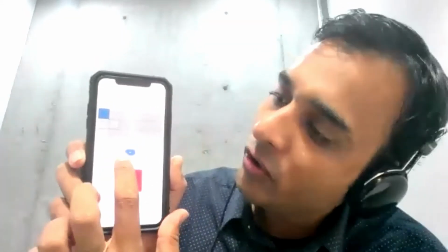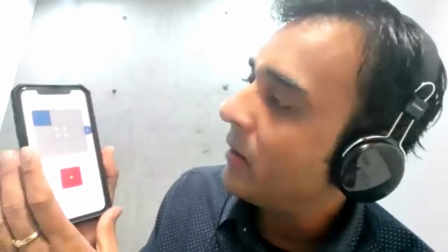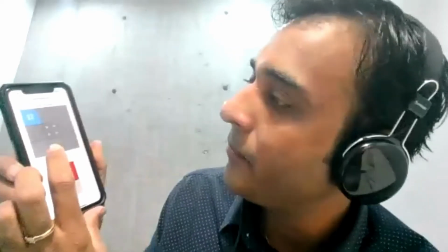Okay. I will click. Look how it would convert. 1, 2, 3. So now you have the whole hemocytometer and your blocks. Then now you just have to count your cells with this finger, the red one. Suppose in this well, number 1, how many cells you see? I see 7 cells. 1, 2, 3, 4, 5, 6, 7. It will even spread like this.